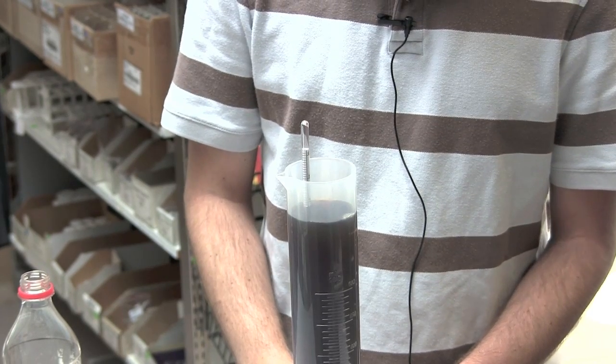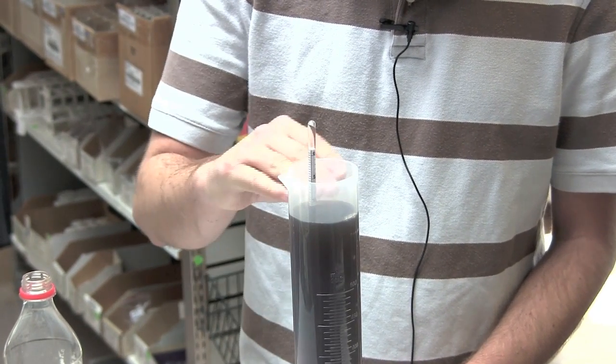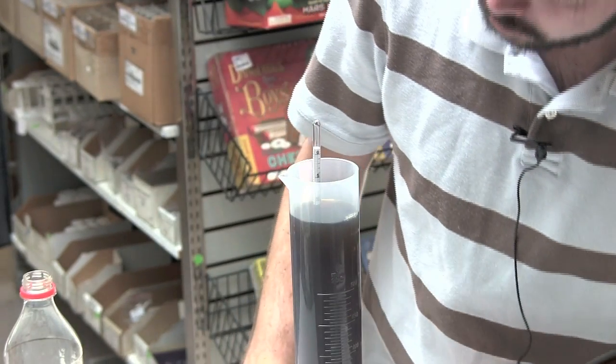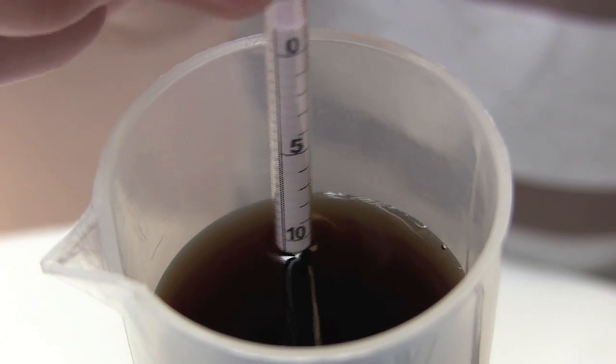Once the hydrometer levels out, take a reading where the surface of the liquid meets the scale on the hydrometer. Looks like in our case it's about 11.